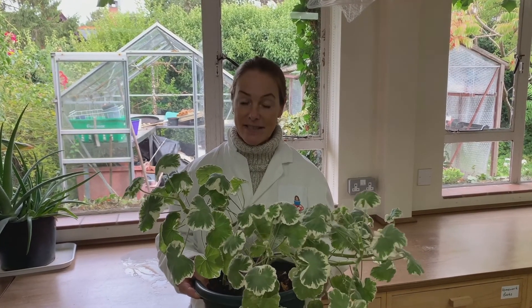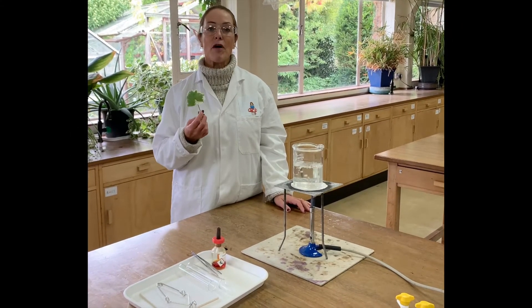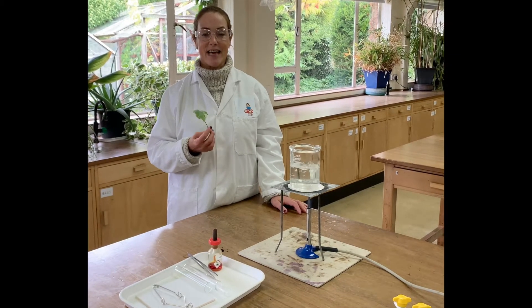After the plant has been in a dark place for a couple of days to destarch, I'm now going to put it on the windowsill for three days so that it gets plenty of sunlight for photosynthesis. After three days in the sun, we take the leaf ready for the iodine test for starch.